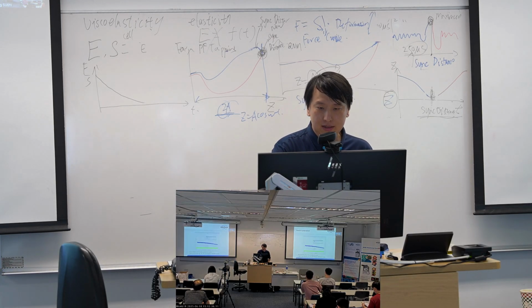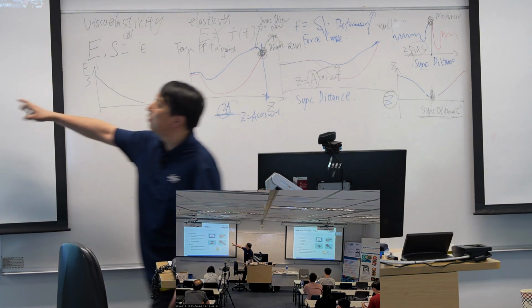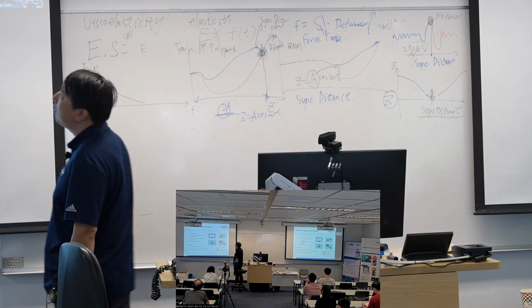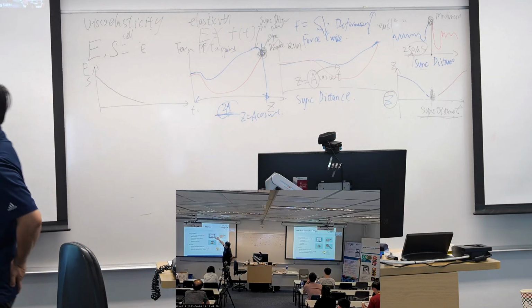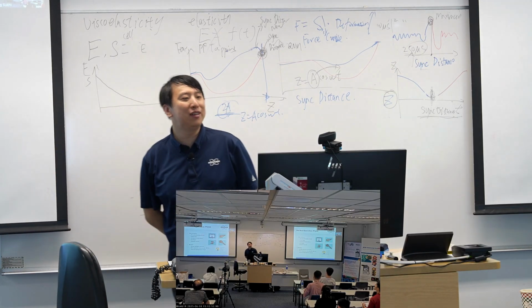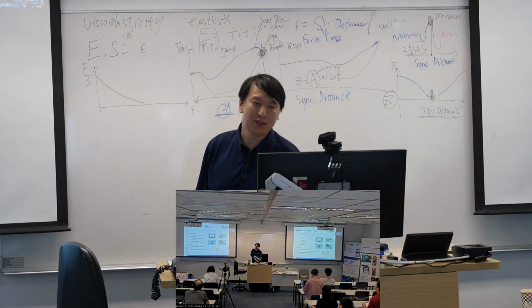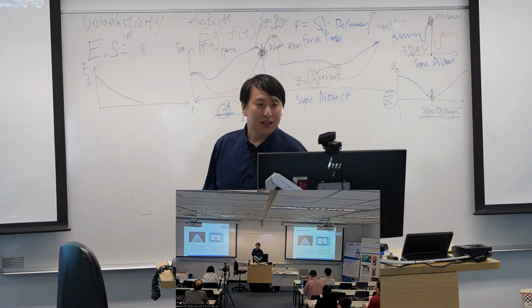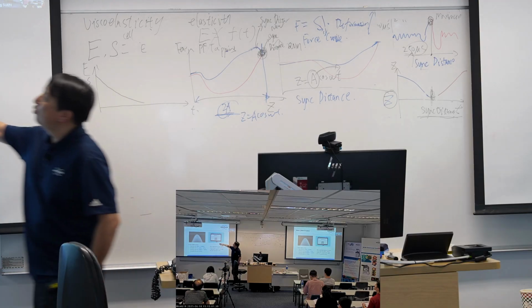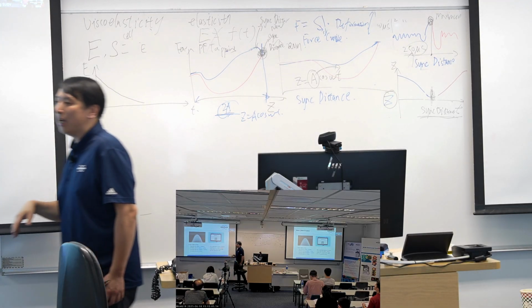In the afternoon, in the hands-on session, we can see those kinds of things. We have a QR code to scan the probes. The probe is already calibrated, the K is already calibrated. We can scan it and capture the K. And the end of the tip is a sphere, so the radius is also calibrated.